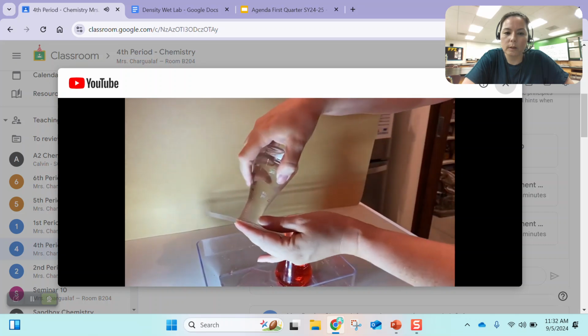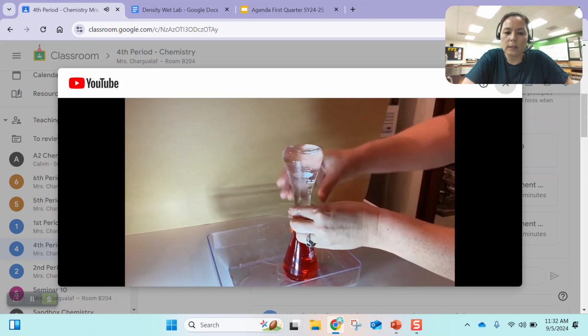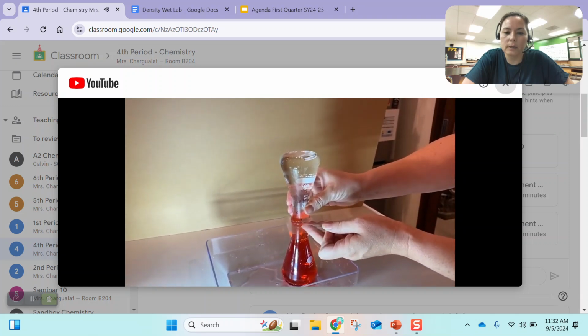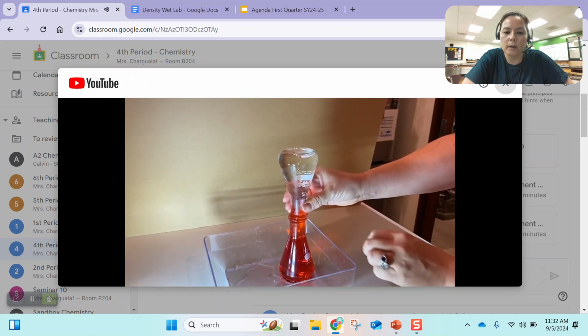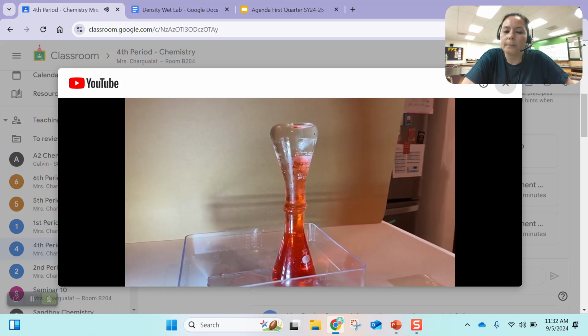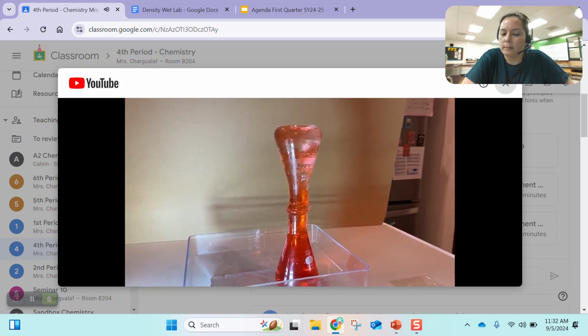So there's the cold water. Instead of a plastic sheet, when you do this, you'll have a yellow card. Notice how they're very slowly pulling the card out, aligning the mouth of the flask together. Now, what do you see there? Notice that the hot and the cold are mixing.